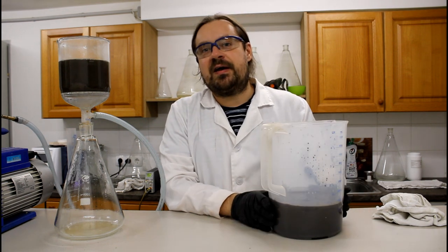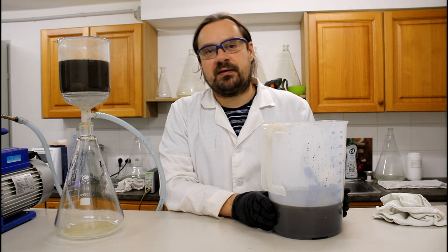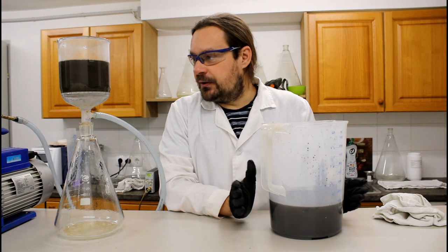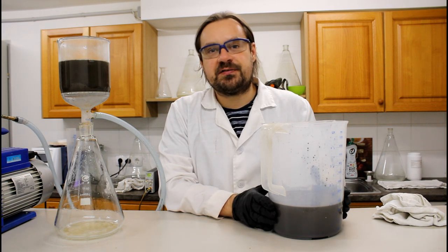Because this is a very fine powder inside, the filtration will actually take pretty long. It could take up to 1 hour. So now we are having to wait till the filtration is finished.